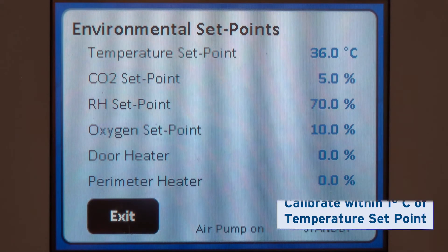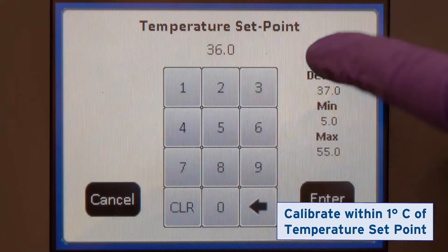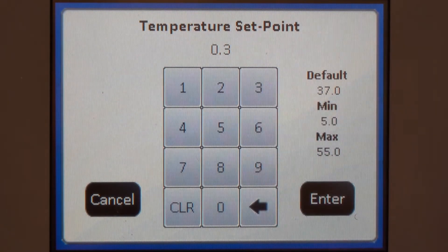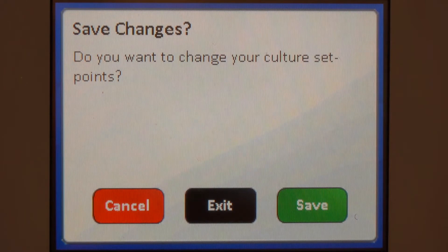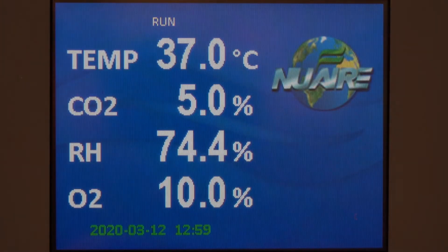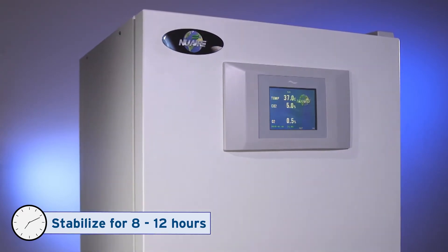You must calibrate when the chamber is within one degree of the desired temperature, so set that now.